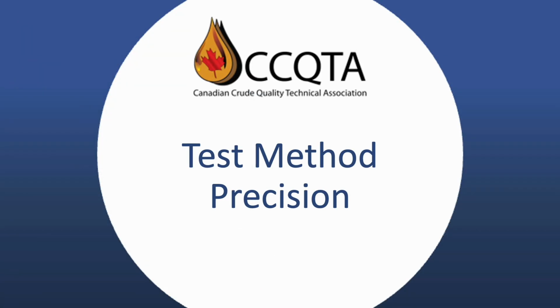When ASTM publishes a test method, it provides important information prior to outlining the procedure. Along with the designation number, which includes the publication year, it also describes the method's use, scope, and possible interferences and other special considerations, if applicable. This is important information which end users should review prior to choosing methods for sample analysis. ASTM also provides a precision and bias statement for their methods, which includes repeatability and reproducibility statements.